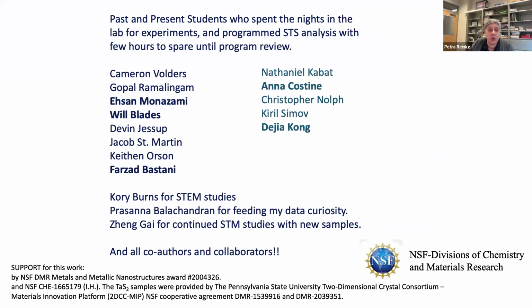I have shown you writing ginormously large defects with STM. And I've shown you where I really would love to go in the future, to have a more data-heavy program, which combines all of these challenges which we still have in 2D materials.